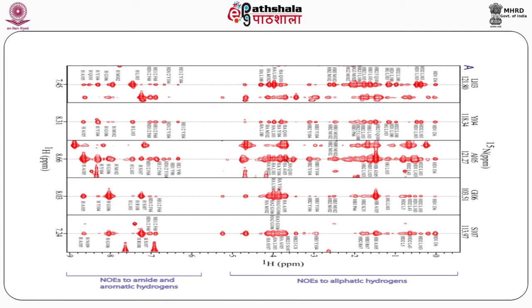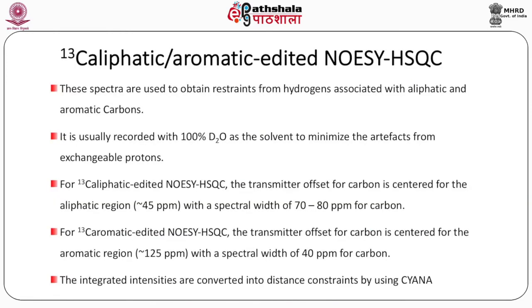Some of these peaks come from the same residue, some come from the adjacent residue, some come from close residues in the secondary structure, whereas many of them are long range NOEs, and this helps to work out the tertiary structure and fold of the molecule.